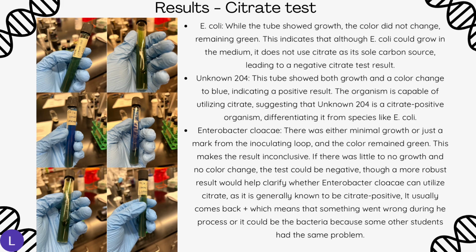First, let's start with E. coli. This test tube shows some growth, but the color didn't change, remaining green, which indicates that E. coli could grow in the medium, but it does not use the citrate as its sole carbon source, leading to a negative citrate test result.